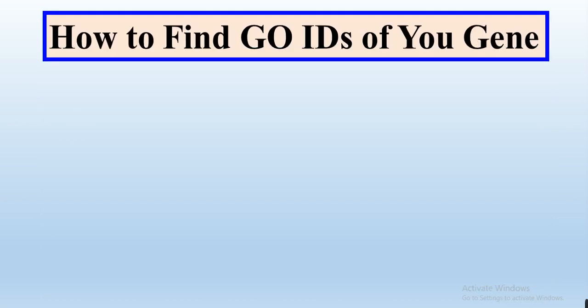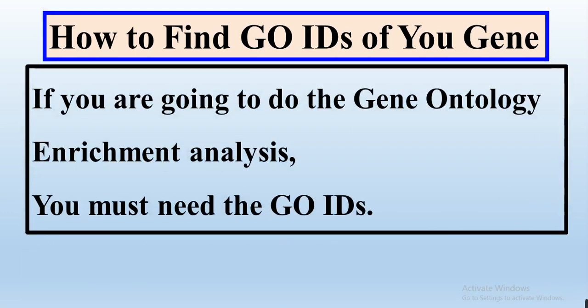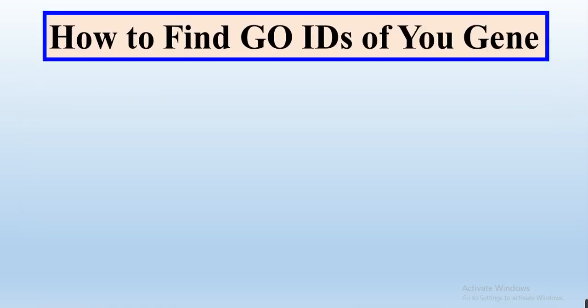In this video, we will learn how we can find the GO or Gene Ontology IDs of our genes. If you are working to do Gene Ontology enrichment analysis, you must need the GO IDs, but sometimes we are unable to get the GO IDs from RNA sequencing data.